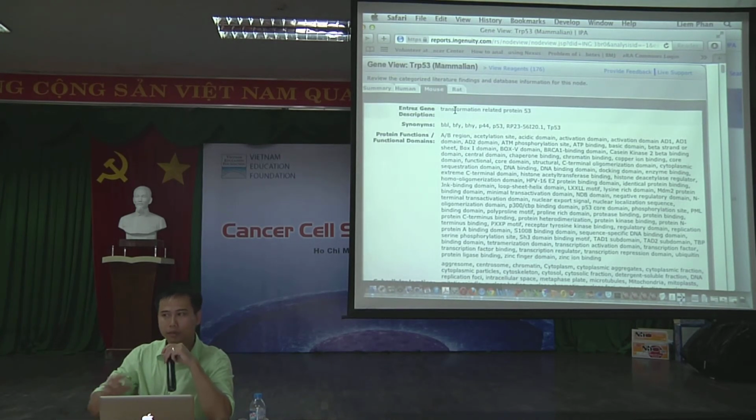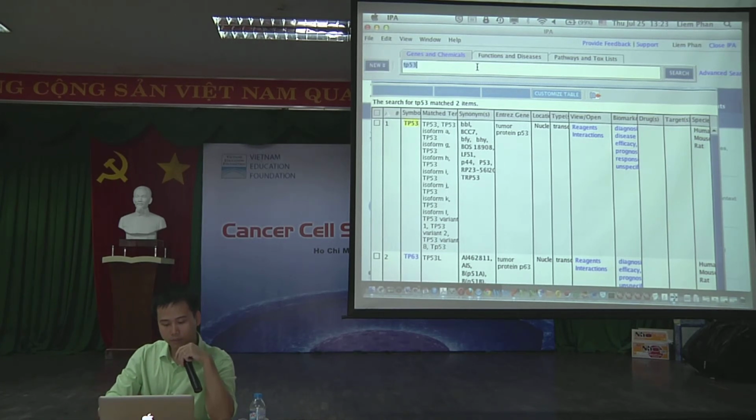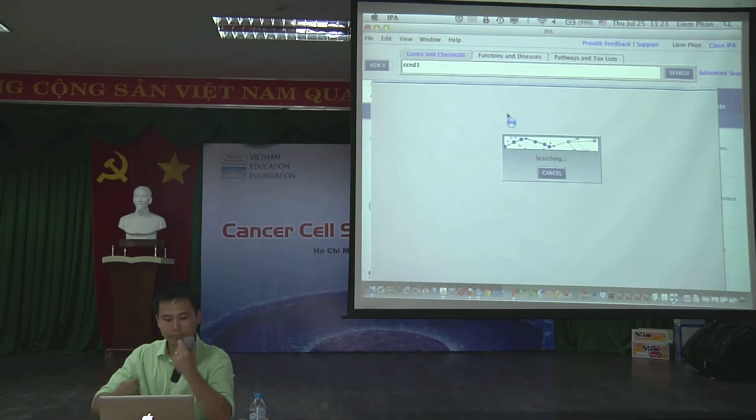Okay. So now I would like you to do the same thing. Log into IPA and retrieve all the information about cyclin D1. I know it takes some time for us to turn on IPA, so please take your time. If you have any questions, please raise your hand and we'll be happy to answer.